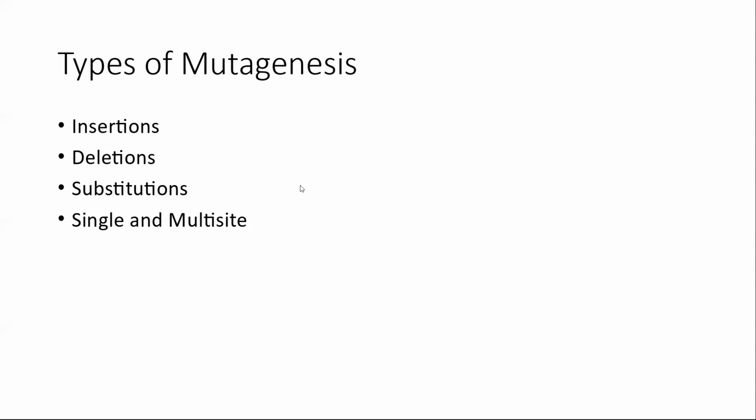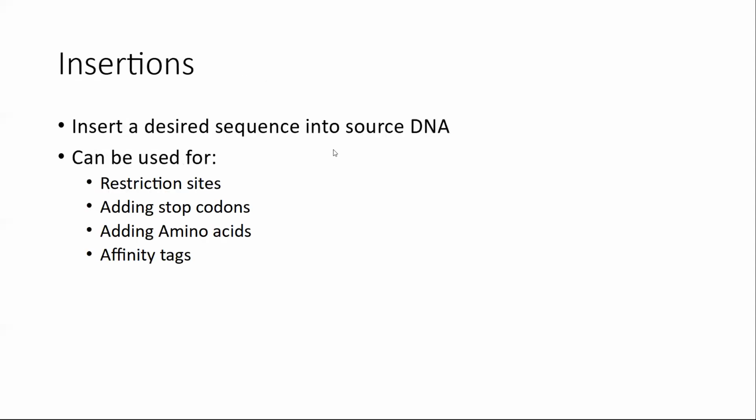So, you know, template variety matters in all these things we do with DNA modification, genetic engineering, that kind of thing. But if the source gene you're looking at is 70% GC content, you just have to deal with that. Usually we're going to add DMSO or maybe some kind of polyethylene glycol if it's suitable with a kit. Typically notes on that are on the manufacturer's website.